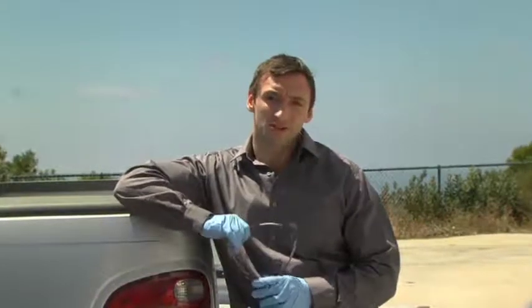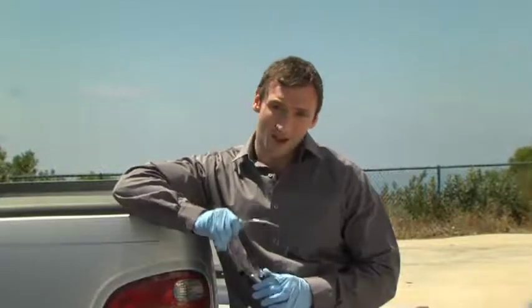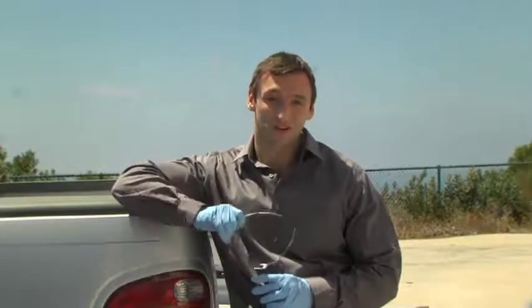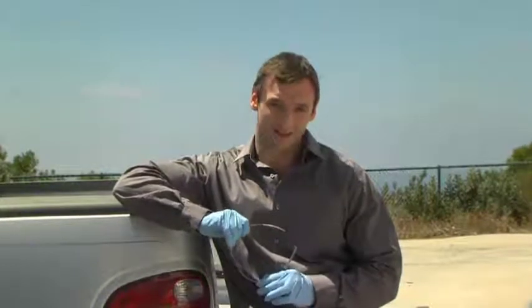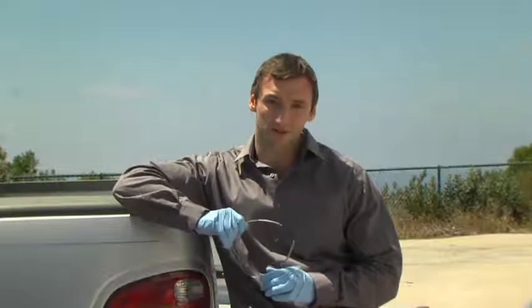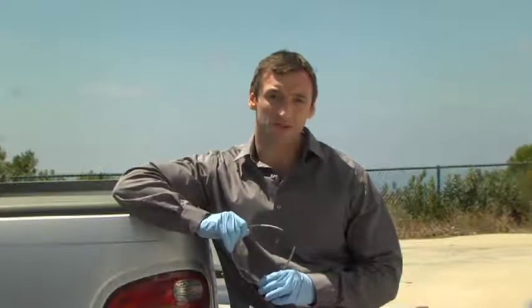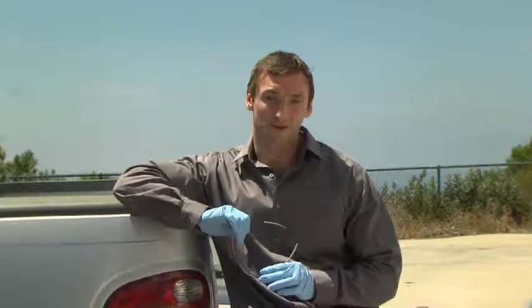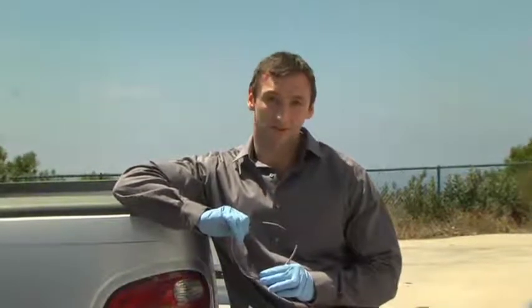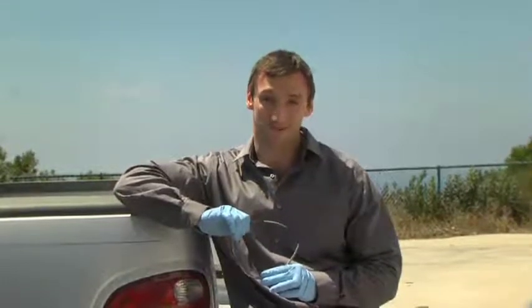The information on each sample container is compared with the information on the chain of custody form. You need to have established a working relationship with your lab so that if there are any discrepancies, the lab knows whom to contact. Response to inquiries regarding discrepancies is time sensitive, since most often a laboratory's procedure calls for them to place analysis of the samples on hold until the discrepancies are resolved. This can jeopardize the laboratory's ability to meet holding times and compromise the data usability.